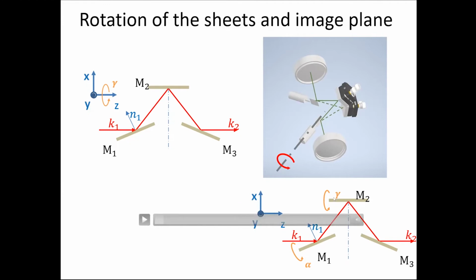So as you can see, the true K mirror will rotate along the z-axis, but these mirrors by necessity would rotate along a different axis. And as it turned out, it essentially diminished the overall image rotation angle. And with existing galvo mirrors, there was no way to rotate by plus or minus 60 degrees.